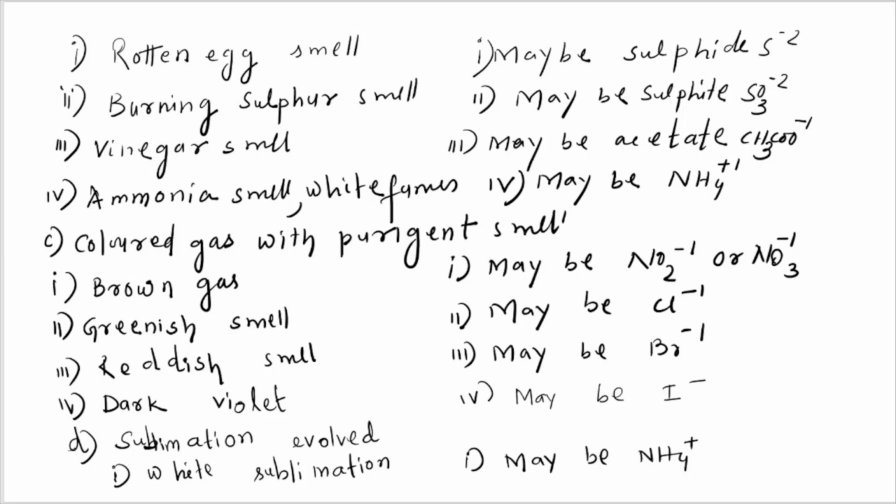Burning sulfur smell. You know what is burning sulfur smell? That means fireworks. When you observe in Diwali, what is the smell coming? That is called burning sulfur smell. If it is burning sulfur smell, then it may be sulfite. What is that radical? SO3 minus 2.